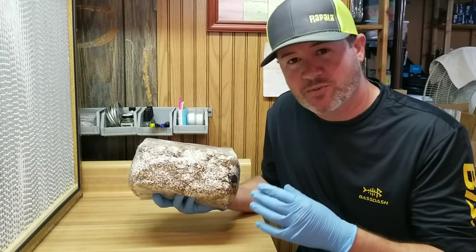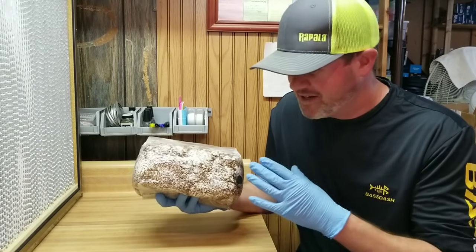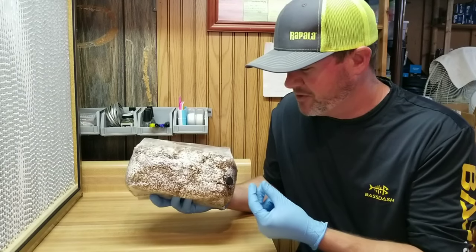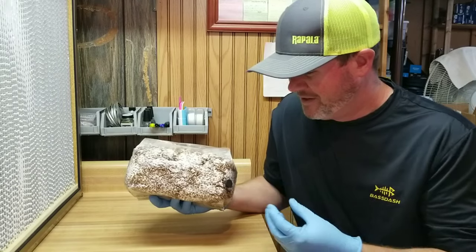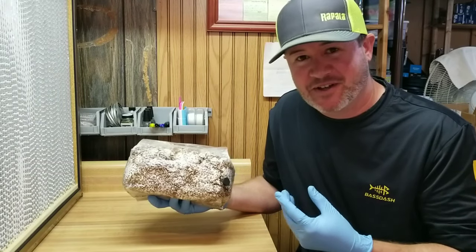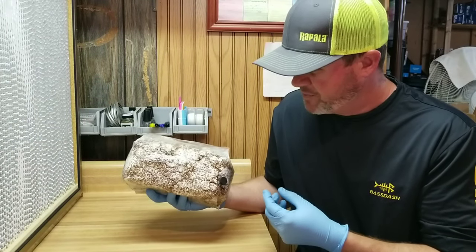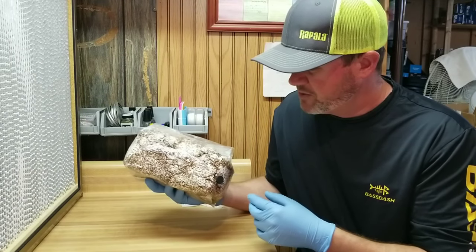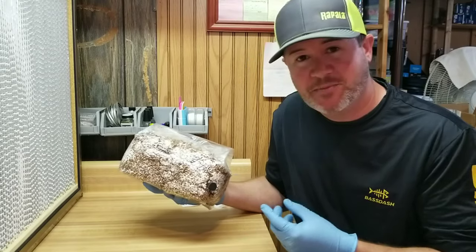This works better with grain spawn than with sawdust spawn because sawdust is really good at absorbing liquid, whereas grain spawn is not as good at that. If you try this with sawdust spawn and inject 20cc of nutrient broth, you're going to have a lot of trouble getting anything back out because the sawdust is going to soak it all up. With grain spawn it will also absorb some, but some of it will pool back into the corner where you can pull it back out.